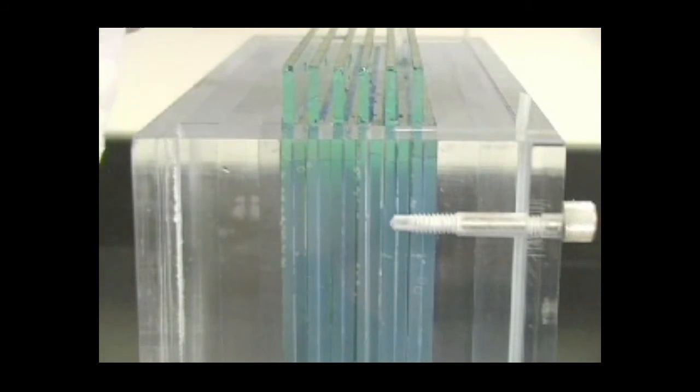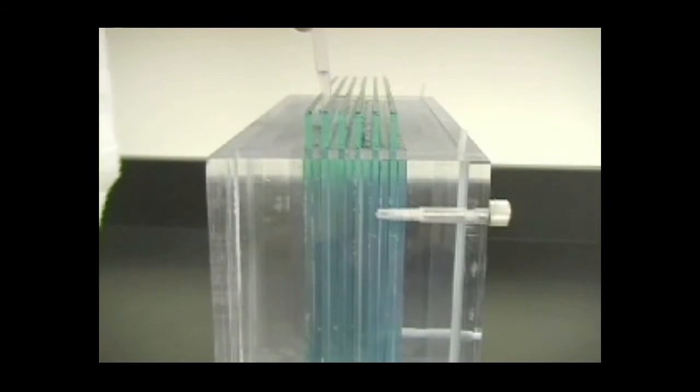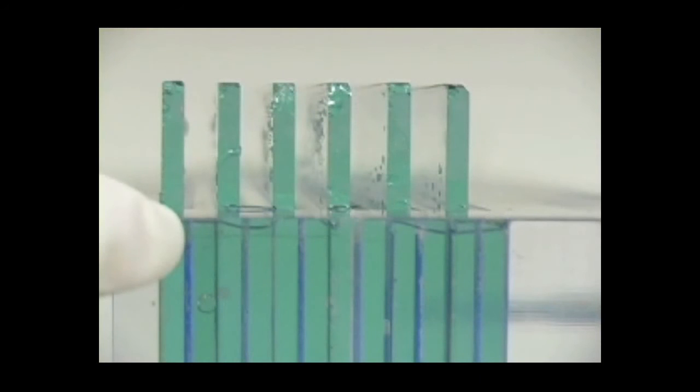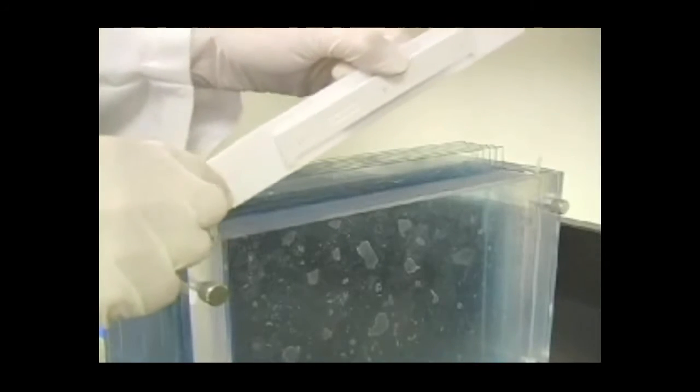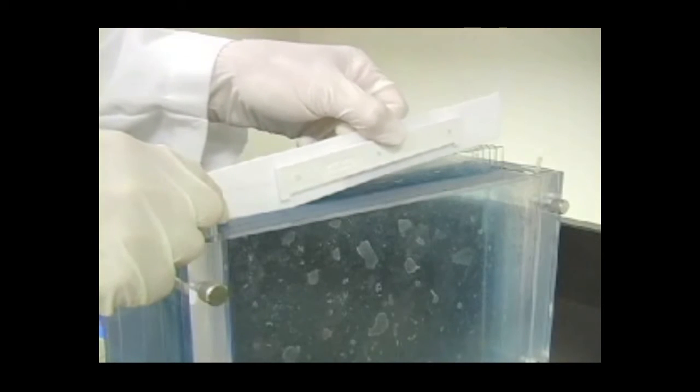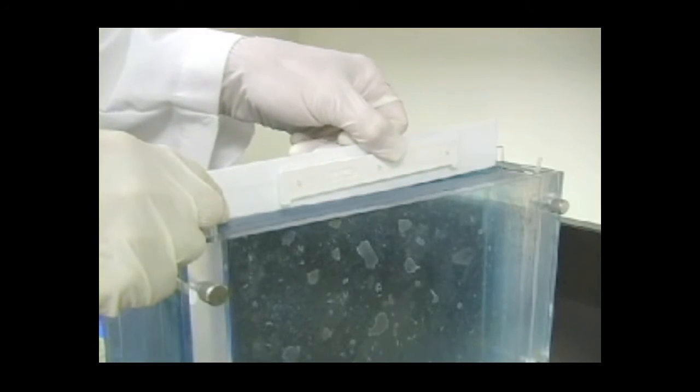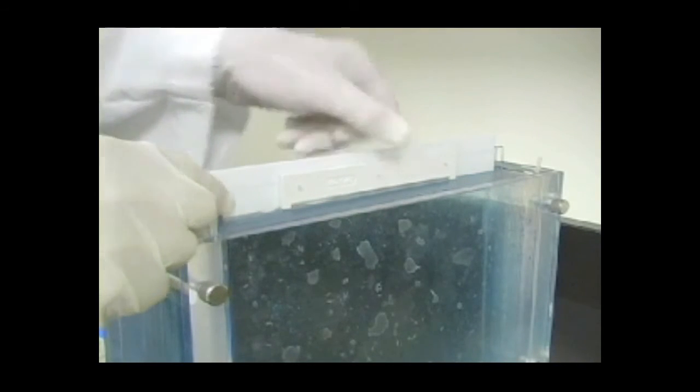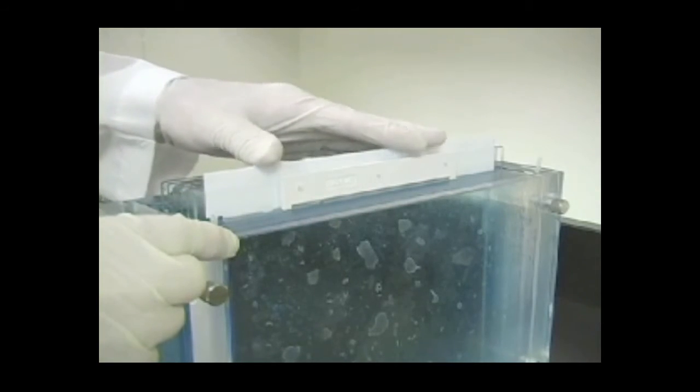Overlay each gel as quickly as possible with the same volume of water-saturated butanol or tert-amyl alcohol. Alternatively, insert a Protean Plus 2D comb into each hinged spacer plate. To minimize bubble formation, insert the comb at an angle.